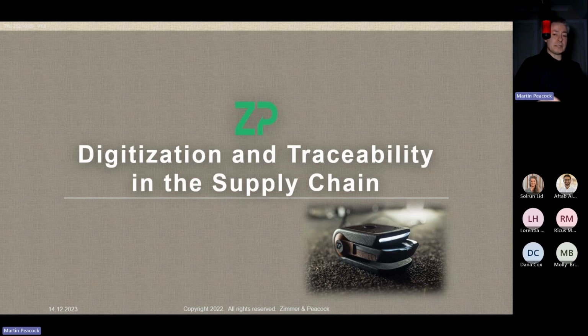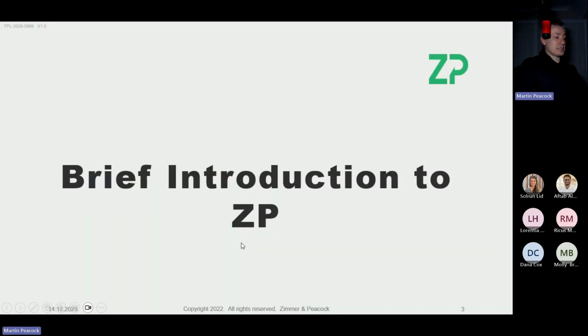I will spend a little bit of time talking about heterogeneity. It's a lovely word, not that easy to say, but for me it's just talking about the fact that chilies and chili powders, for example, are quite complex samples. The capsaicin is not evenly distributed throughout, and it does give some interesting challenges when running things like Scoville heat unit determination on powders.